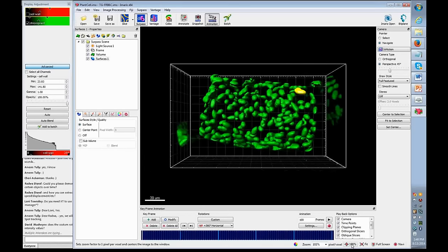So that means that Imaris will go back to these 3 frames and run the spots detection again in a very small region of interest that is close to the predicted position for that object at each frame, and try to find the spot even though it was a little bit below the initial quality threshold.